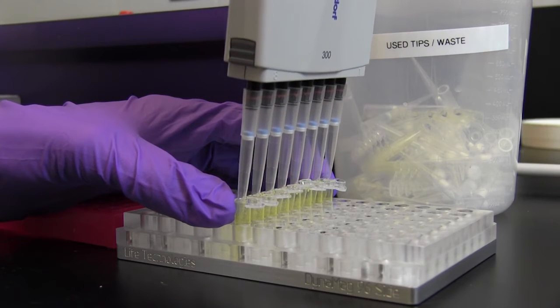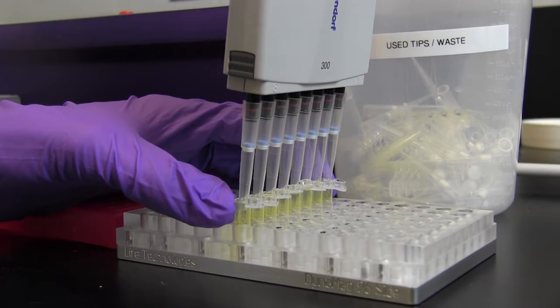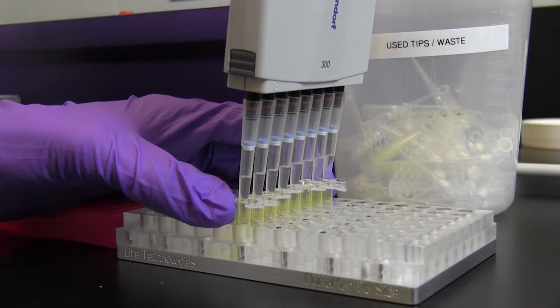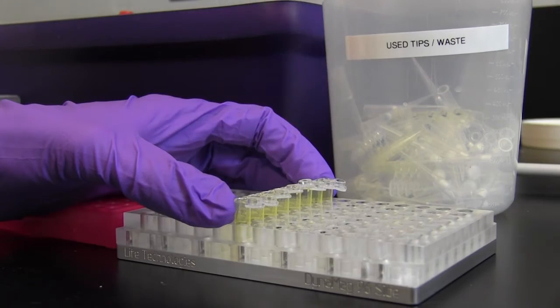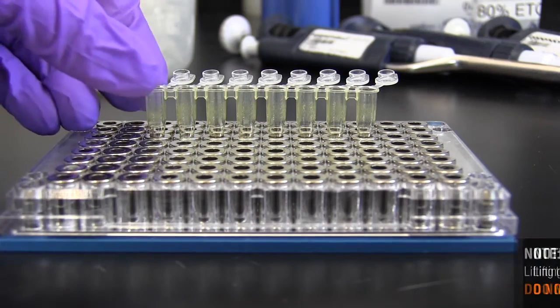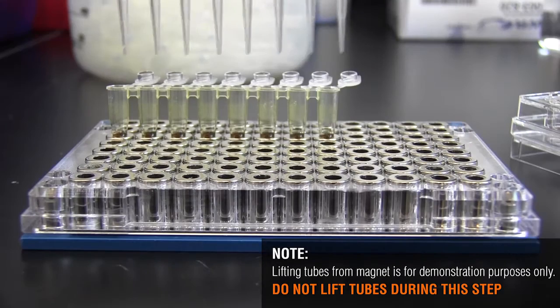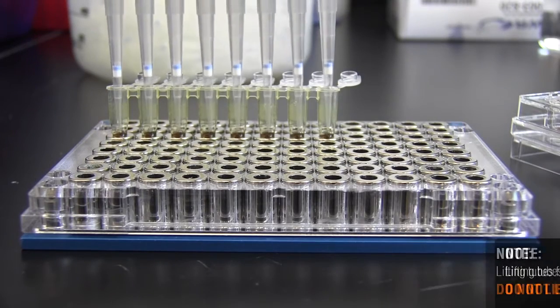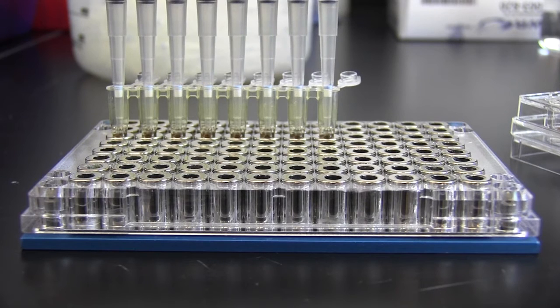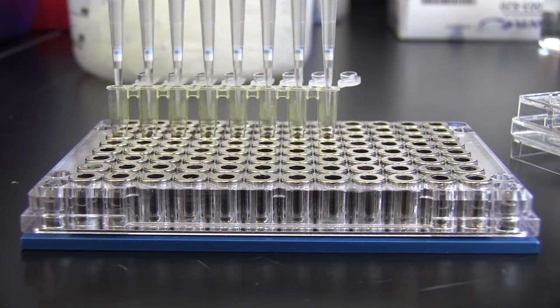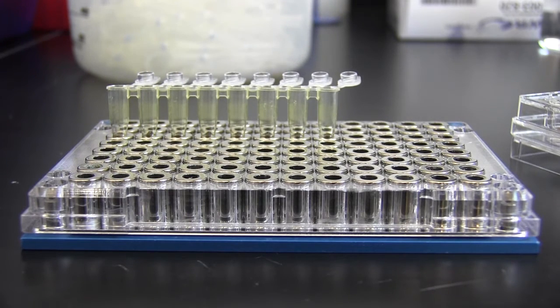Vertical bar magnets pull the beads to one side of the tube or well and the supernatant can be removed by placing the pipette tip on the opposite side of the tube or well from the magnet. Plates with circular magnets pull the beads uniformly to the walls of the tube or well so the supernatant can be removed by pipetting straight down into the bottom of the tube or well, being careful not to touch the sides.